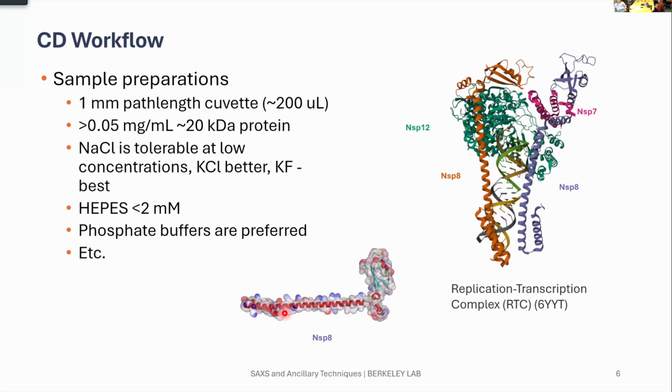In my project, what we wanted to do is find out the best salt conditions where we can get the most stable structure, with potential application for crystallography.